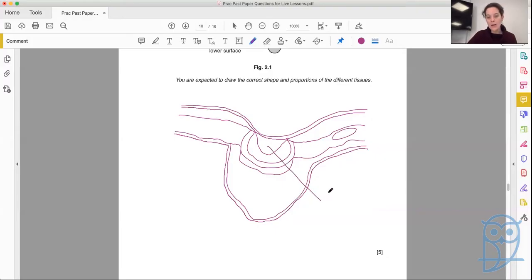So there's our one line and our vascular bundle. Finished. And we leave it. We don't go labeling other things. We never shade anything. Okay, it's all just lines to indicate the edges of a tissue. And we move on.